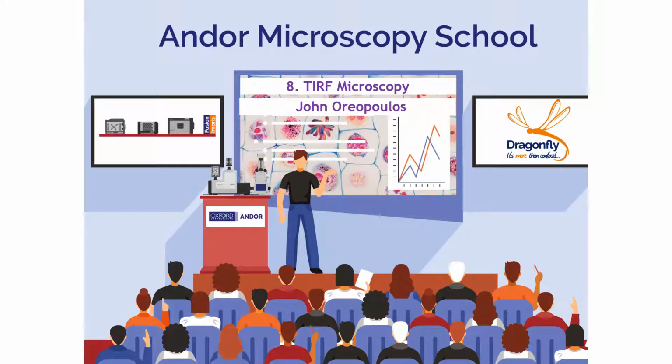I'm a microscopy systems specialist at Andor Technology, and today I'm going to be introducing you to the technique of total internal reflection fluorescence, or TIRF microscopy.